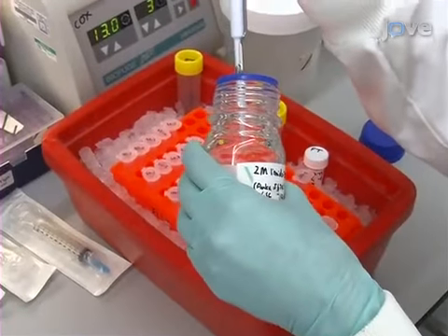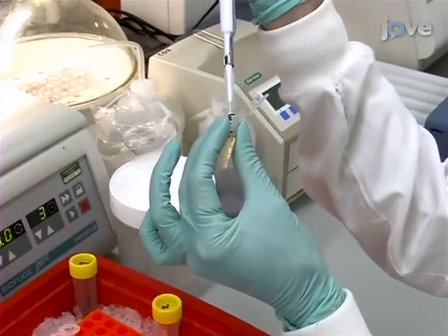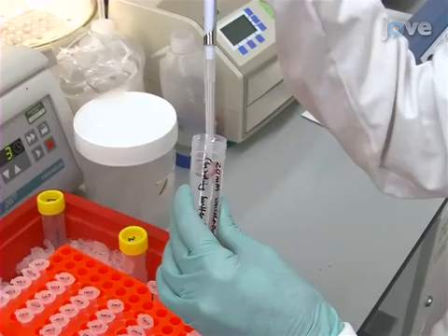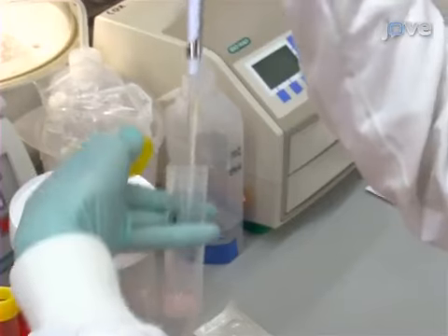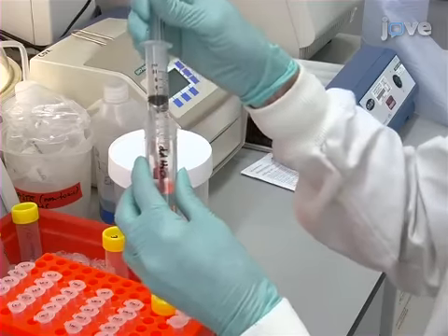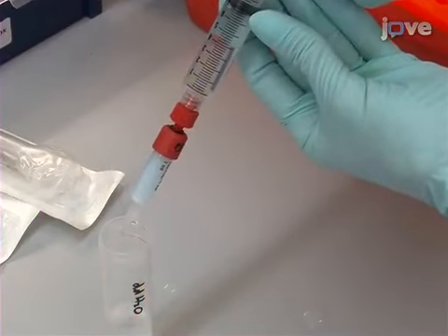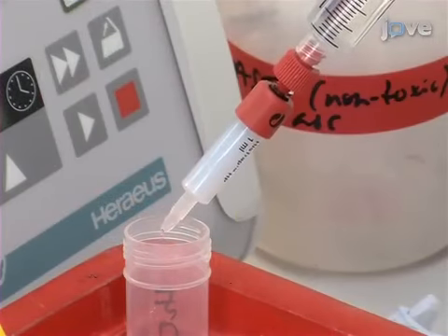First, adjust the bacterial lysate to 20-millimolar imidazole using an appropriate volume of 2-molar imidazole stock solution. Then adjust the volume to at least 1 milliliter using 20-millimolar imidazole. Wash a 1-milliliter HisTrap column with 10 milliliters of MilliQ water. Then equilibrate the column with 10 milliliters of 20-millimolar imidazole.